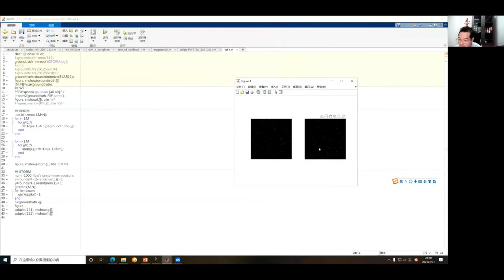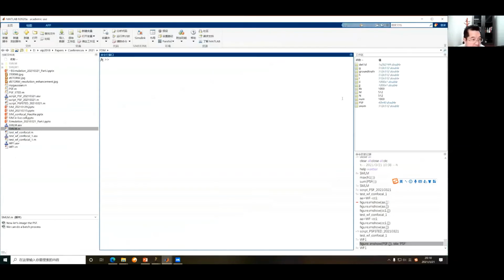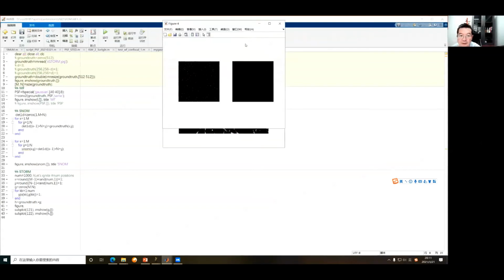So here we should notice the type here, not 512. All right.